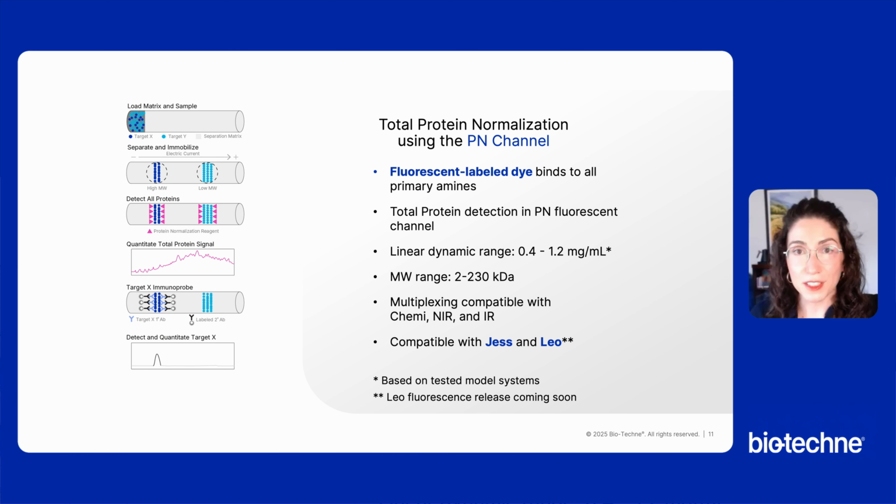The third option is total protein normalization using the protein normalization or PN channel. This method uses a fluorescent dye that binds to all primary amines and is measured in a dedicated fluorescence channel, the PN channel. It provides a different detection range compared to the first 2 approaches and is fully compatible with our fluorescence-capable instruments. Unlike methods that use the replex module, total protein detection in the PN channel occurs before immunoprobing. This approach also supports multiplexing with any of the other 3 channels for a flexible workflow.